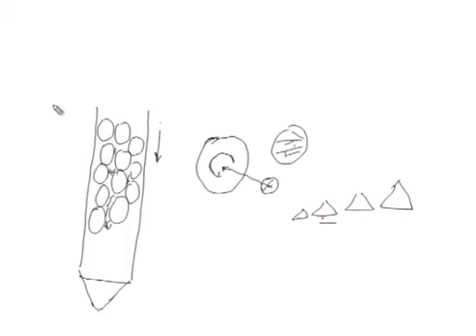So, that is how the separation occurs, because they are moving down, though you have a continuous flow system, at different speeds or at different rates actually, which are eluted at different rates. So, this is a very simple basic principle of column chromatography, of gel filtration chromatography.